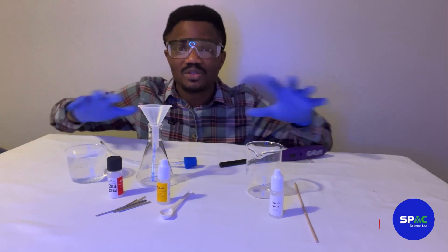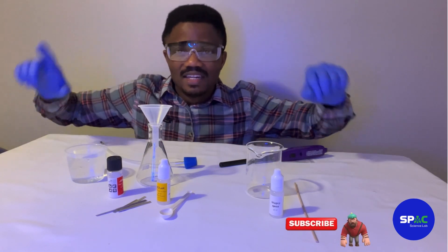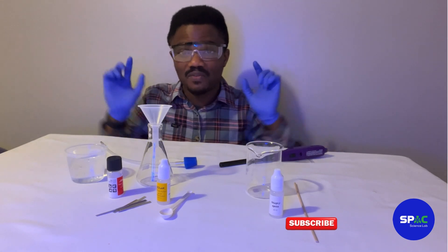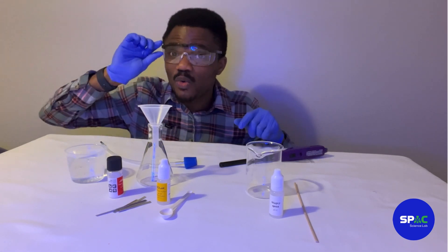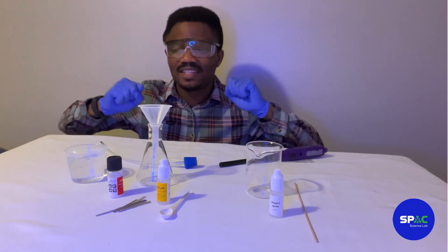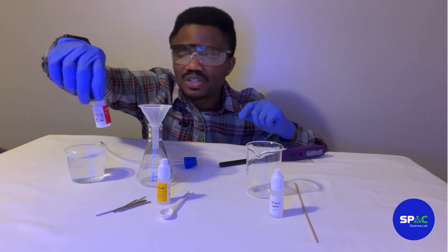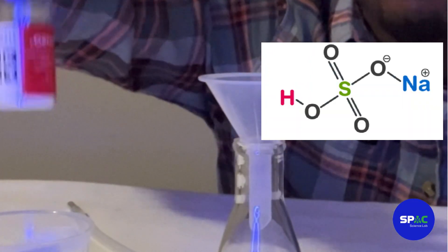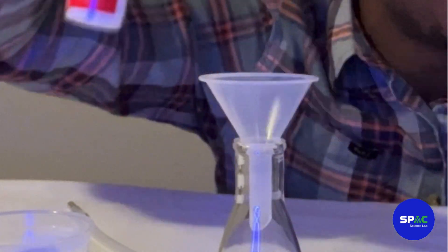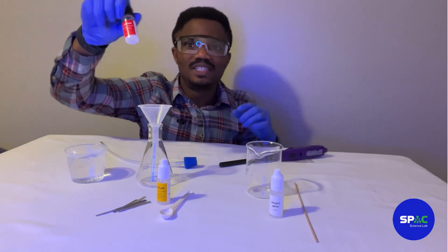Before we go to the experiment, I would like to show you all the chemicals we are going to use to make our hydrogen gas. But first, if you are doing this at home, always make sure that you wear your safety goggles. So the first thing we have here is sodium hydrogen sulfate — its chemical formula is NaHSO₄.